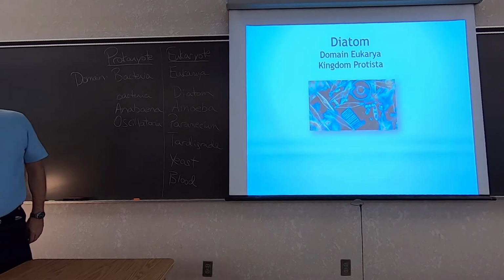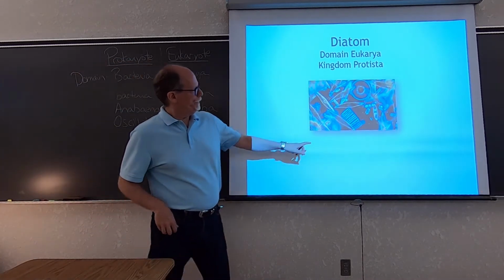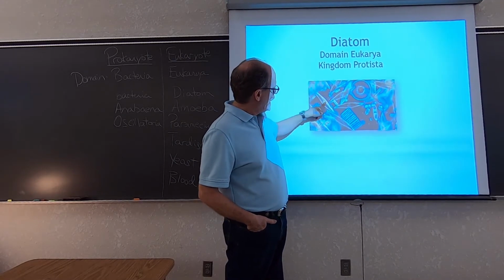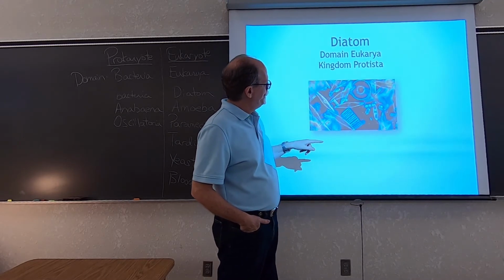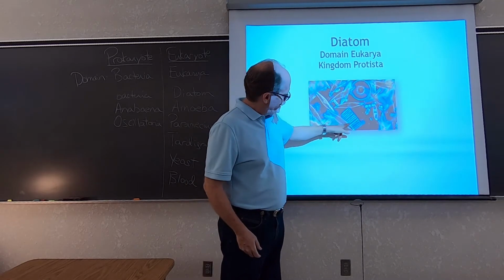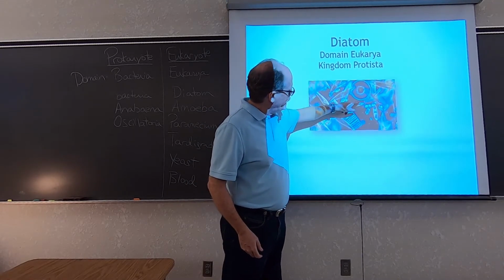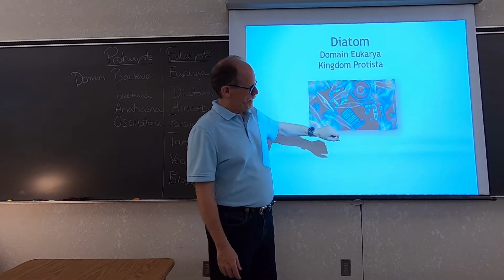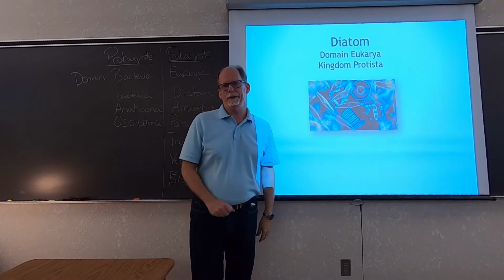So, right, when you look at this, this is pretty complicated too. Each one of these guys is one organism, one type of diatom. These are another type of diatom. This is another type. So there might be 4 or 5 different diatoms actually in that one image.